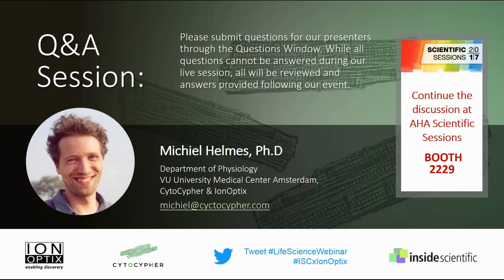Absolutely. It's critical that you control your environment very well so the cells survive for a long time. And one of the key things is to let the cells stabilize before you measure them. We stabilize them by plating them on laminin and letting them sit for an hour. And then we put them in the microscope, and from my experience, you can do 20 minute experiments max before the cells start to deteriorate. But it turns out not to be true.